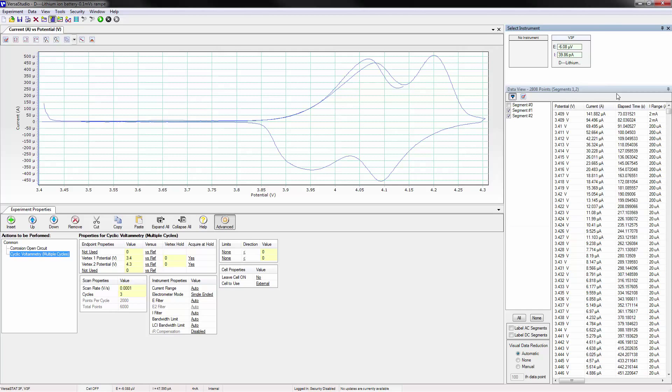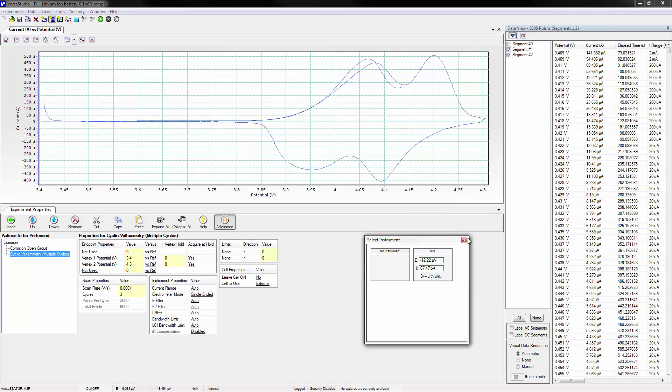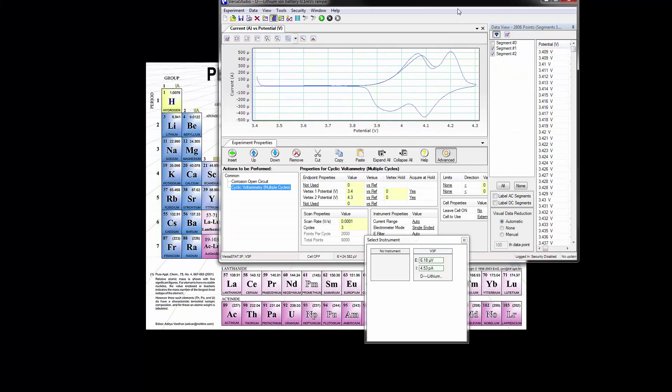Unlike the other windows in Versus Studio, the select instrument window can be pulled out of Versus Studio by left-clicking and dragging to anywhere on the screen. This allows it to act as a standalone window that can be moved independently of Versus Studio.